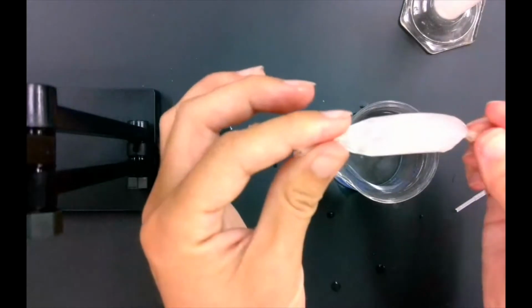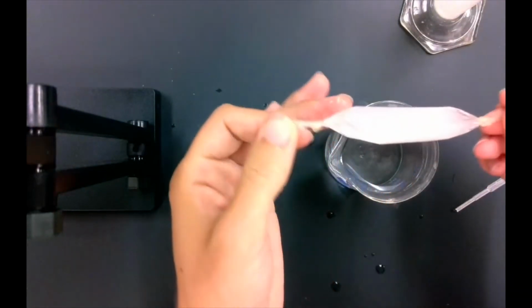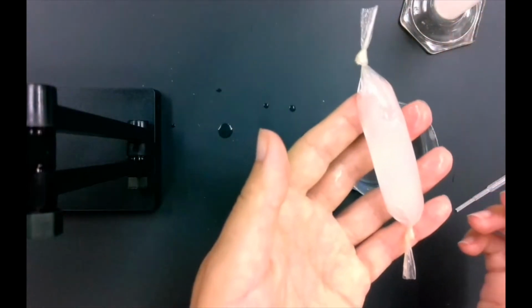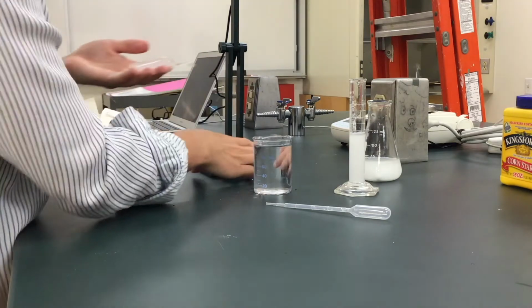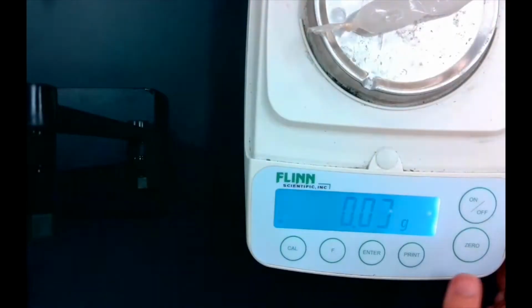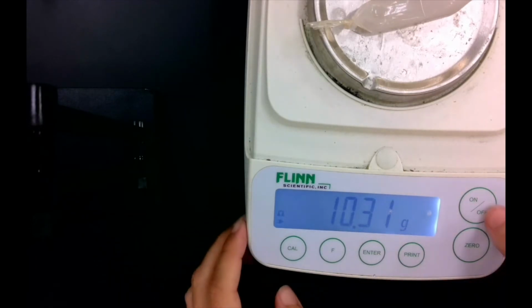So it's like a little candy full of glucose and starch. Now I'm going to take the mass of this, so we're going to go back to our scale. And I need to record this mass. Okay, 10.31 grams is the mass of our bag. Great. I'm going to turn this off.